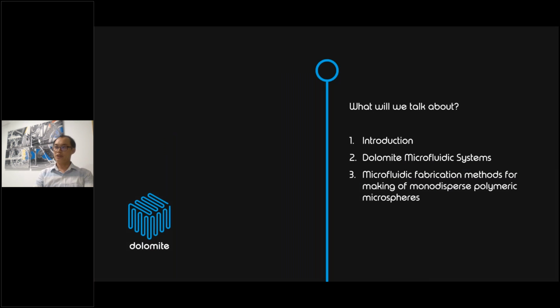So the content of the presentation today will include the introduction, and then we move to the introduction about the Dolomite microfluidic system, and the final part will talk about the microfluidic fabrication methods for making monodisperse polymeric microspheres.